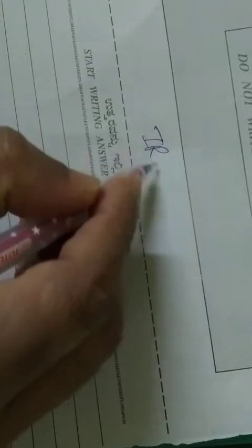Hello students, today we'll go for the last video of this chapter of IR spectroscopy. Today we'll cover the instrumentation of IR spectroscopy.